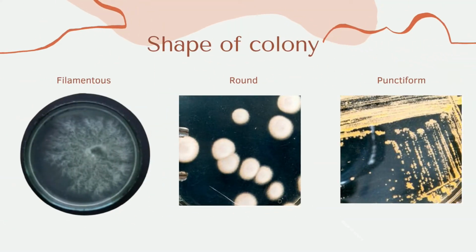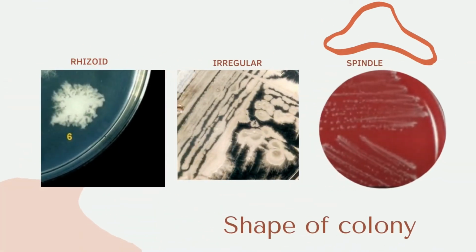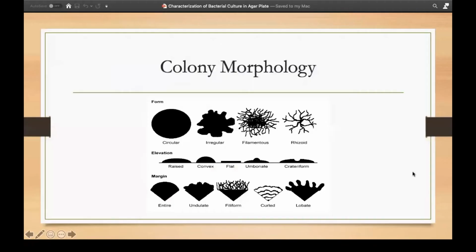Shape of colony. Size of colonies. We have many colony morphology or characteristics of bacterial cultures.